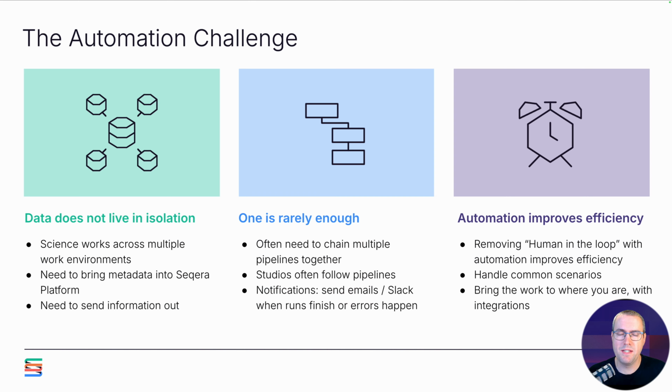So this project came about because of a few different reasons. Firstly, we know that all of your data and everything you need is not just within Seqera Platform. You need metadata and raw data files from outside, and when you finish your pipelines, you probably need to do downstream analysis or notifications. All of these things require different interactions with other environments.